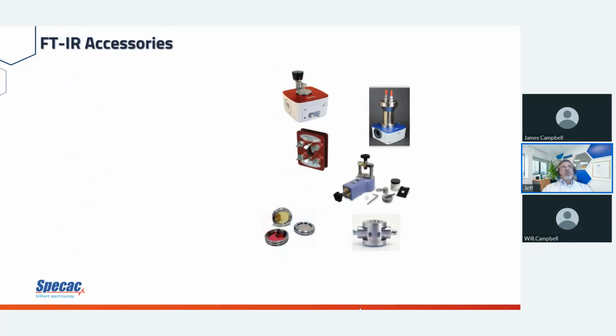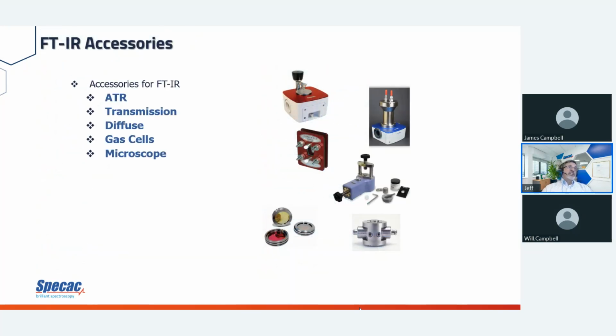So what are the FTIR accessories? ATR, transmission, diffuse reflectance, also specular reflectance. That should just be reflectance accessories. Gas cells, microscopes. Sample preparation.